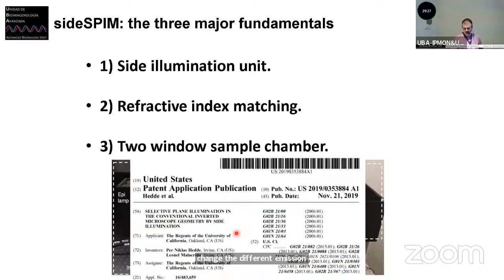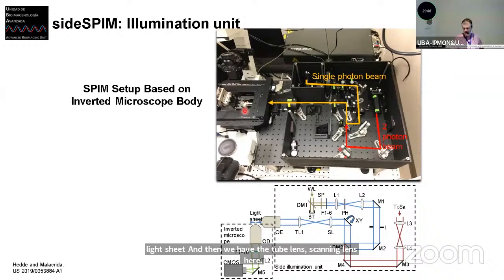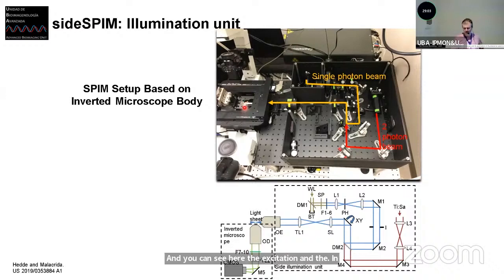And this was finally a patent that we filed together. And just to explain a little bit of the configuration, the most important thing here is you can see the scanner. We use a scanner in order to generate this light sheet. And then we have the tube lens and scanning lens here. And you can see here excitation and emission in the optics. And we managed to put together single photon excitation and two photon excitation, because for some of the applications that I'm going to show, we require two photon excitation.